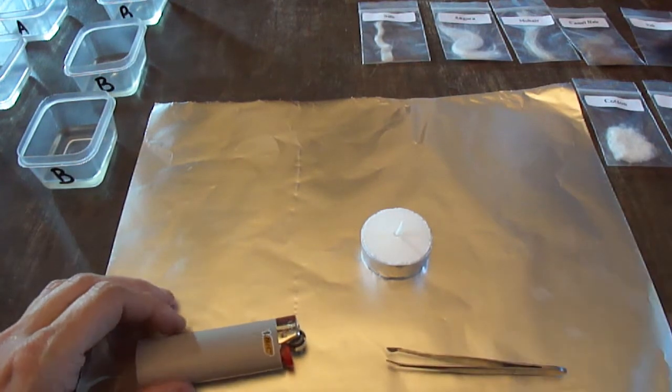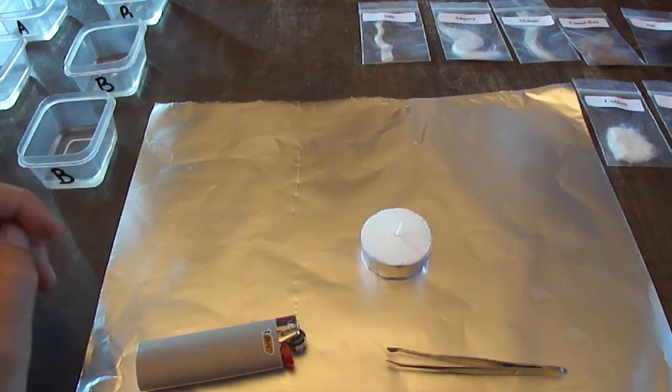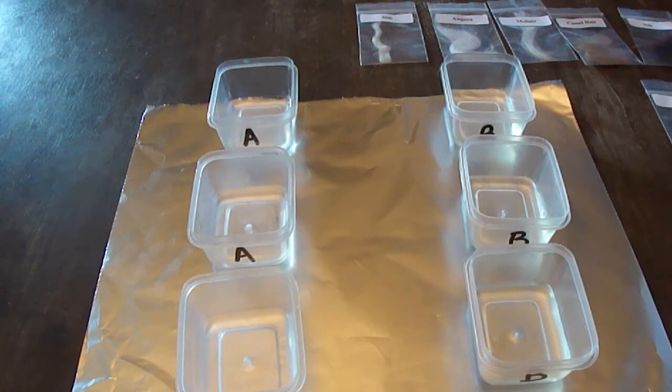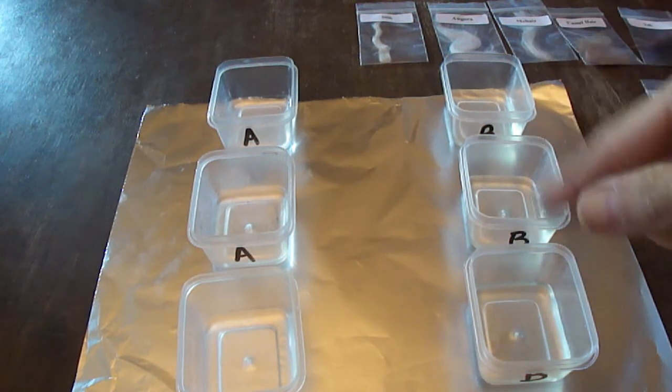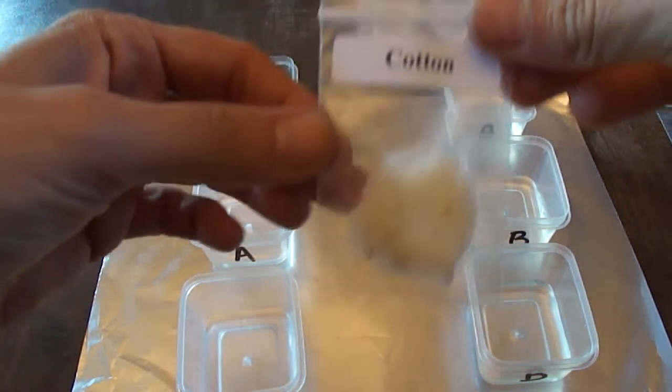I'm using my phone as a timer. The first thing I want to do is set up for my solubility test since I've got to leave the fibers in the chemical solutions for at least 30 minutes — I can get that going first and then do the burning while I'm waiting. There are lots of fibers to show you, starting with the natural cellulosic fibers like cotton.